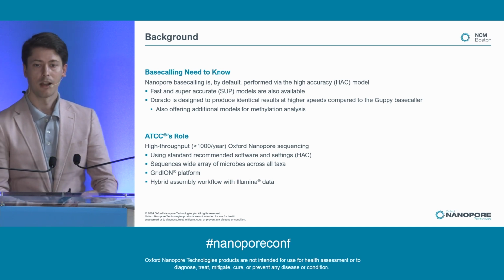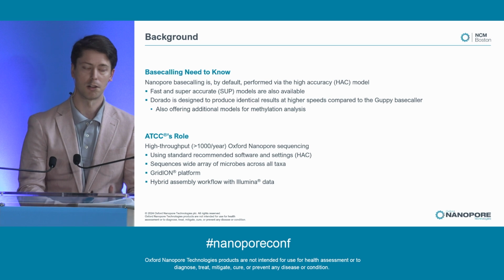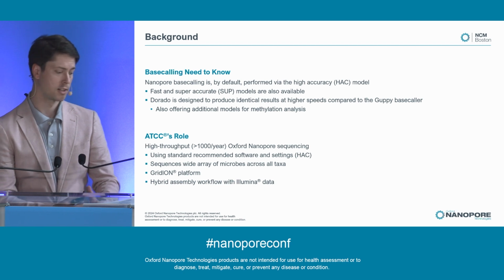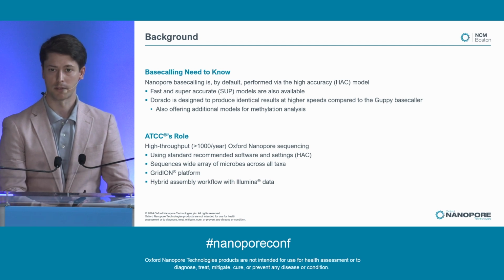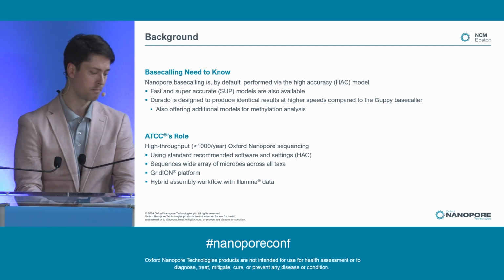So part of the Genome Portal has required the Oxford Nanopore sequencing technology. The long reads have been absolutely essential in the bacterial and the mycological collections, and steadily more so in the virology collections as well. Now, until recently, the base calling has by default been performed with Oxford Nanopore manufacturing specifications, which is to say the high accuracy base calling mode.